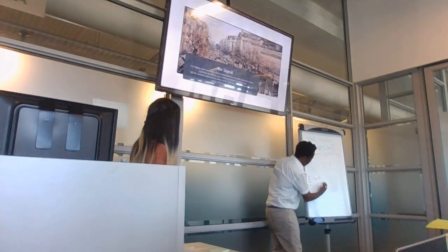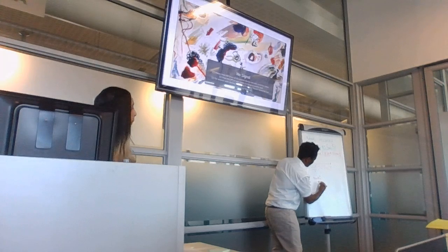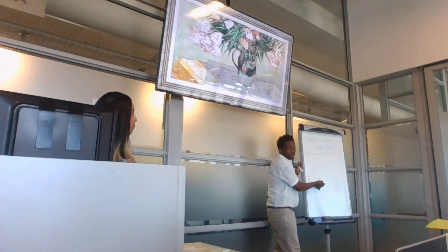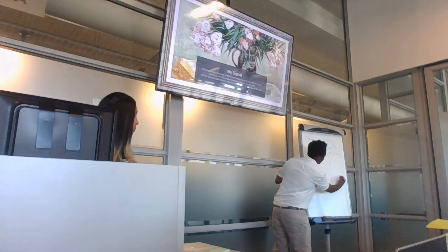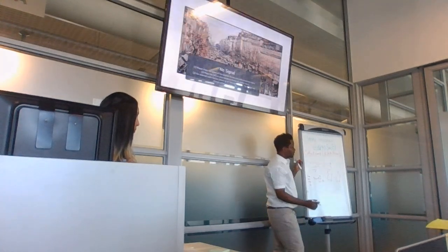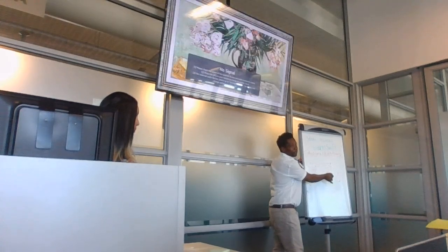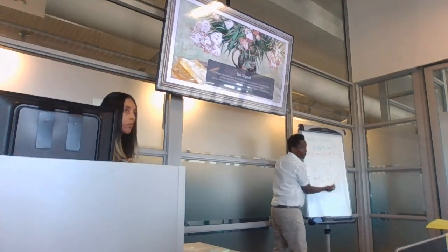We do the same thing again, but because of the overlap, some of it will be covered by the forward read. So we want to assemble. With Illumina, you get two files, and these two files are separate: this is the reverse and this is the forward. Your question is, if we take the reverse and hit it back at the genome, do we get the same information or other information compared with the forward read only? In the case where they are not equal, yes.